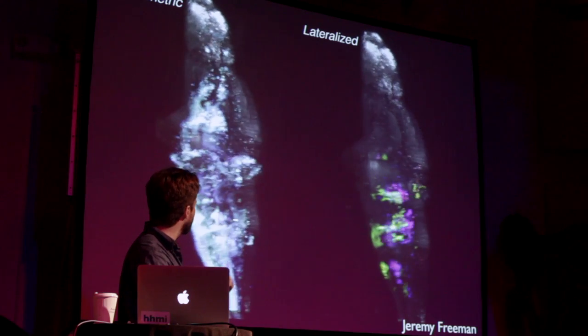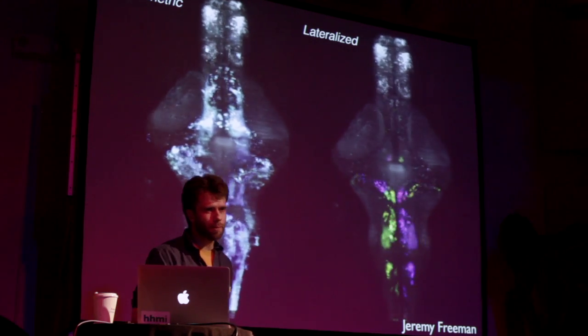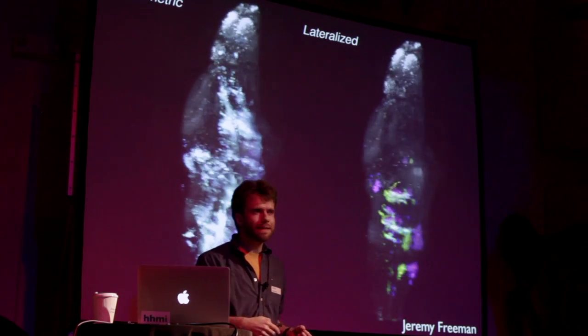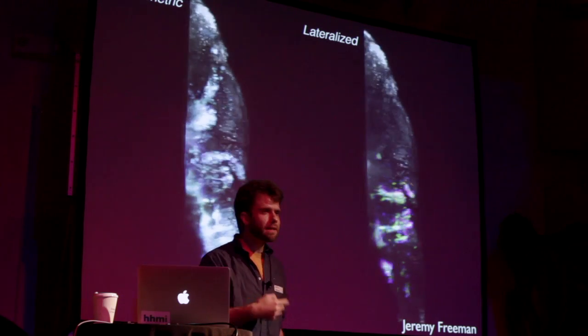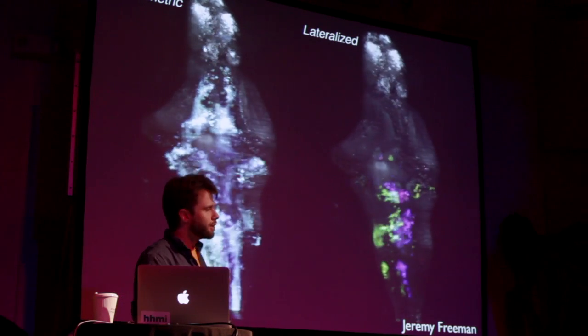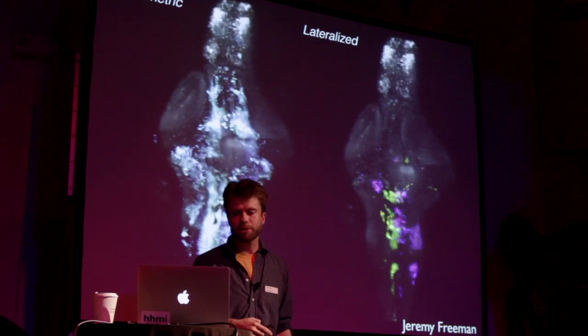You can see single neurons. You can see neurite tracts. You can even see what look like two single neurons in the forebrain. So very clear anatomical structure from this very simple analysis in about 20 minutes of data. So this gives us great hope that we'll be able to use these technologies for solving more complex integrative problems in the future.